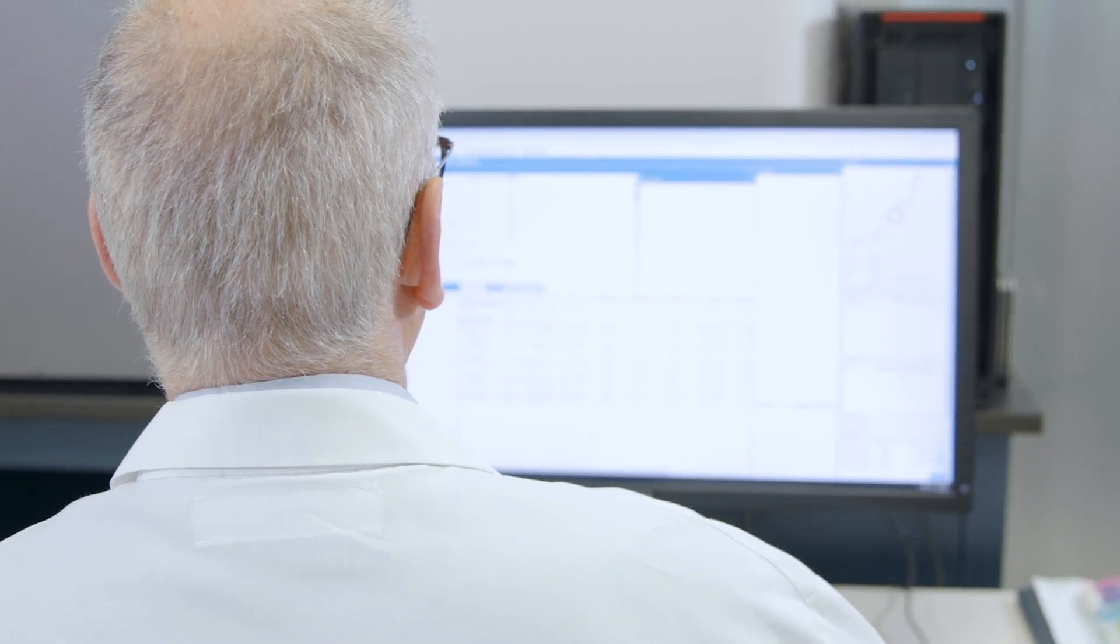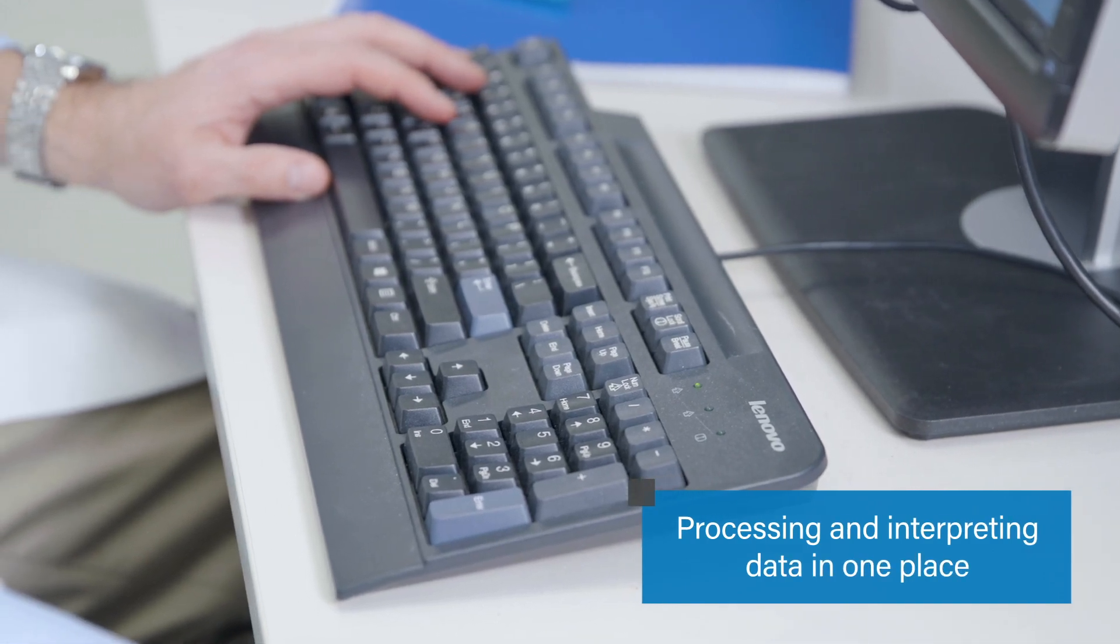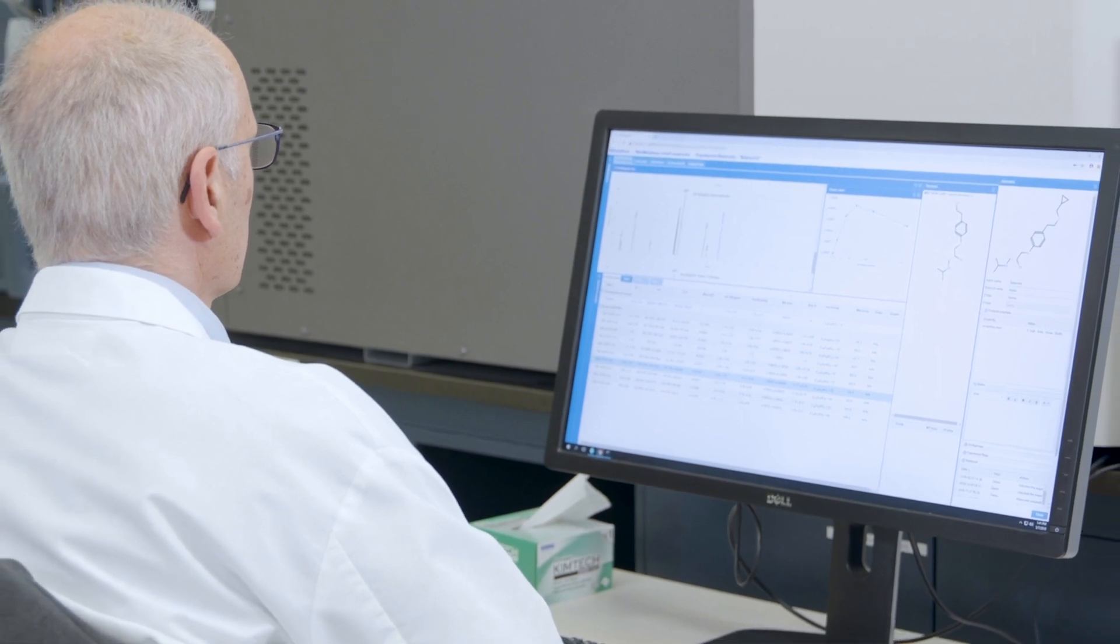Both Mass MetaSite and Web MetaBase are able to process and interpret HDMSE data and make full use of CCS values when comparing and rationalizing outcomes across studies.